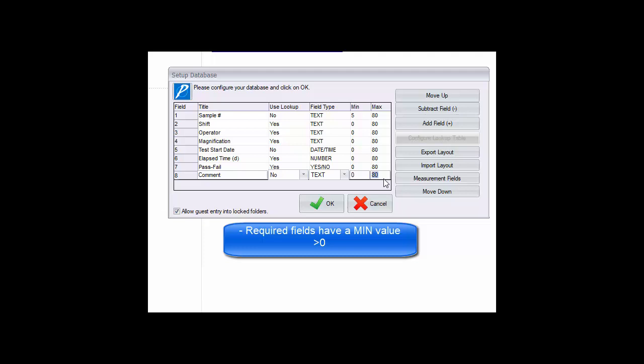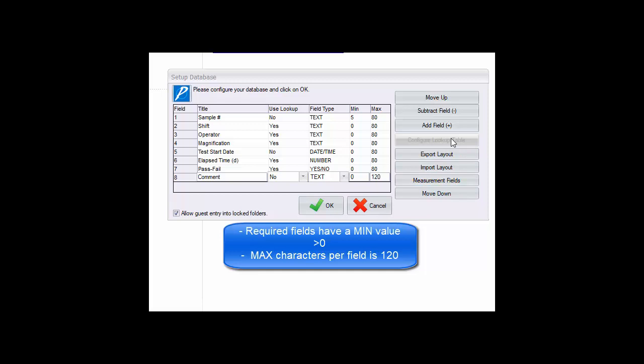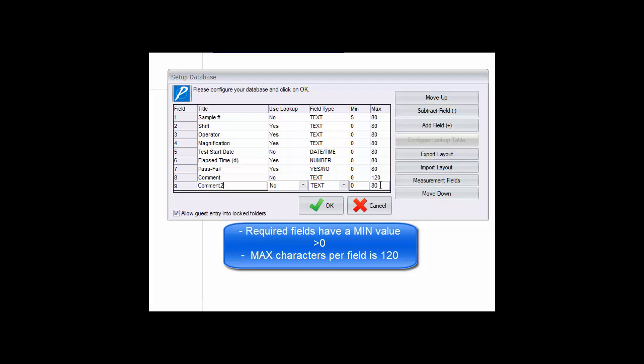Side note: if even longer comments are needed, a second comment field may be created or you may want to check out the notepad feature associated with each image in the Paxit collection.